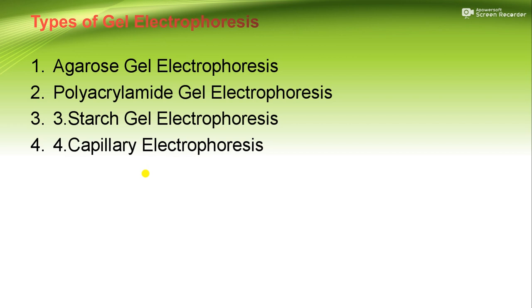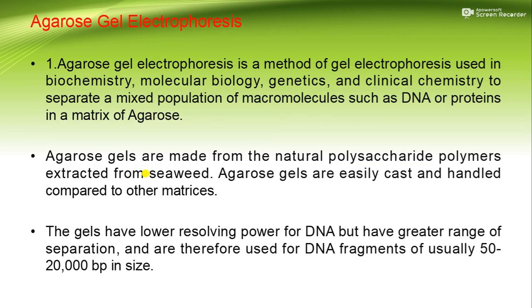Types of gel electrophoresis. 1. Agarose gel electrophoresis. 2. Polyacrylamide gel electrophoresis. 3. Starch gel electrophoresis. 4. Capillary electrophoresis. Agarose gel electrophoresis.